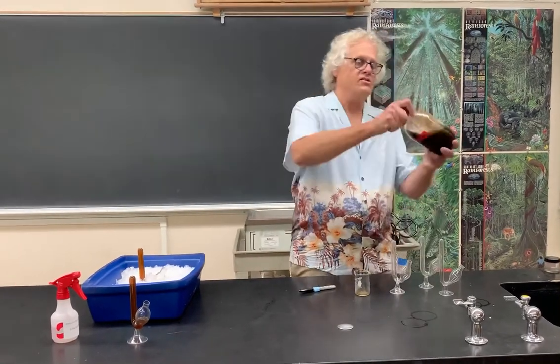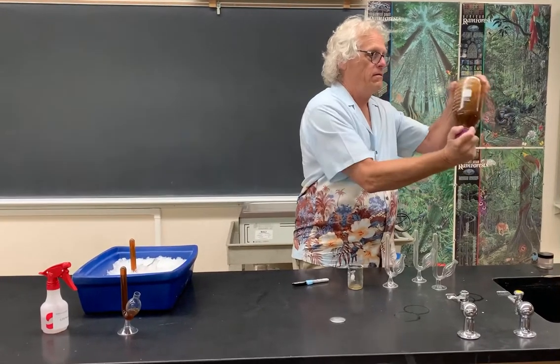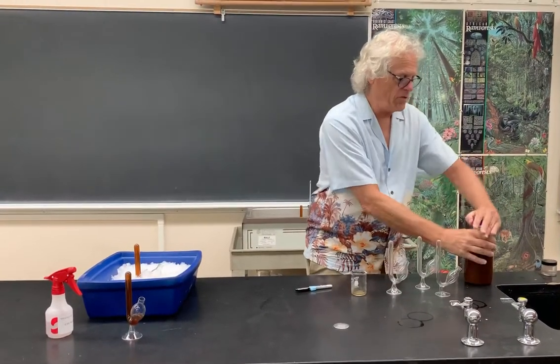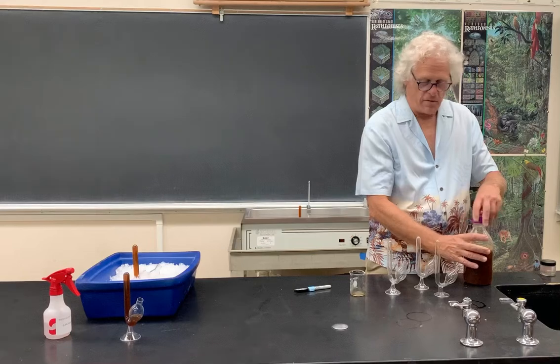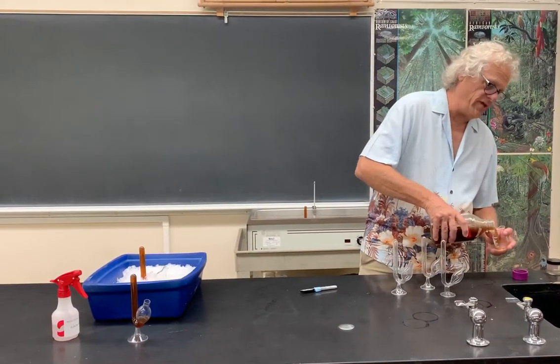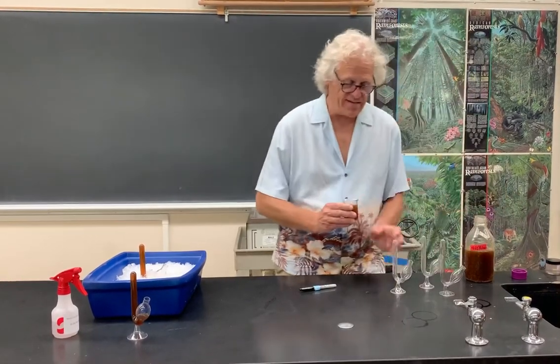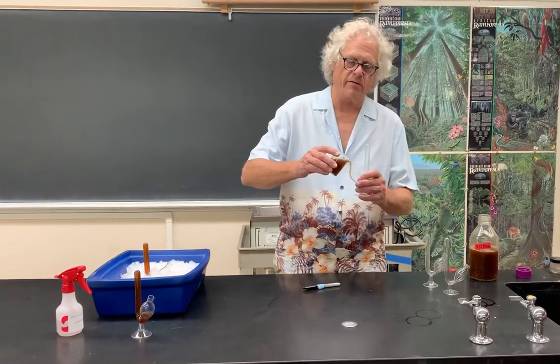Now I've got the molasses with the yeast in it. It's well dispersed now. I'll use my little beaker again to pour it. I'll fill up 3 of these fermentation flasks now with molasses and yeast. It smells good. It smells like I'm making beer.